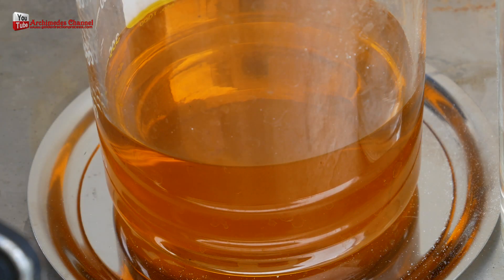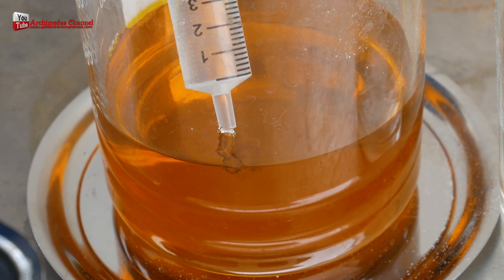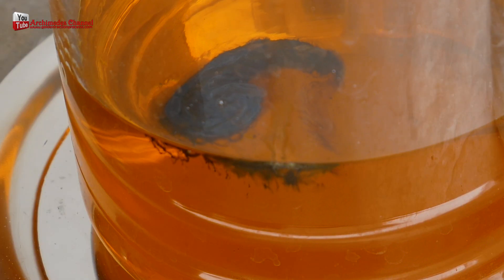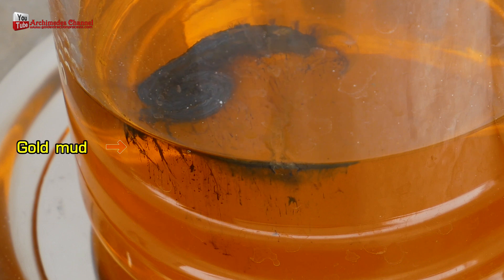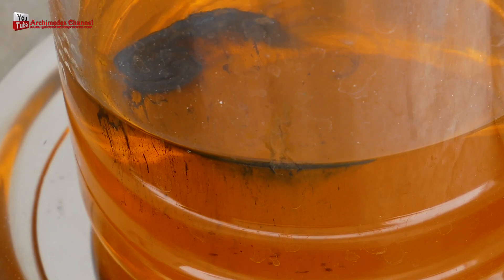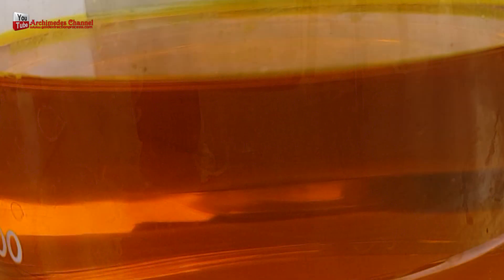Use sodium metabisulfite to precipitate gold out of the aqua regia solution. You will get a gold sludge powder that looks like mud. Sodium metabisulfite, also known as sodium bisulfate, is an affordable and effective selective precipitant for gold. The chemical can recover up to 99.95% of pure gold when the precipitated gold is thoroughly rinsed. It works well even at room temperature.